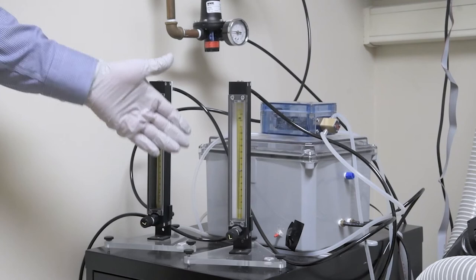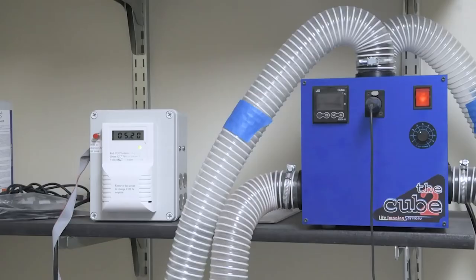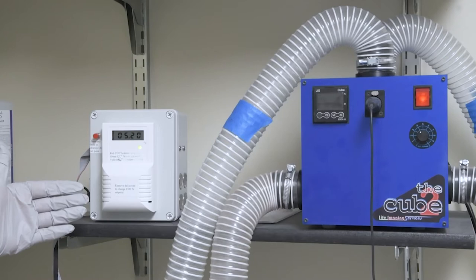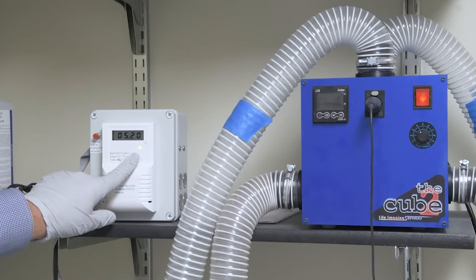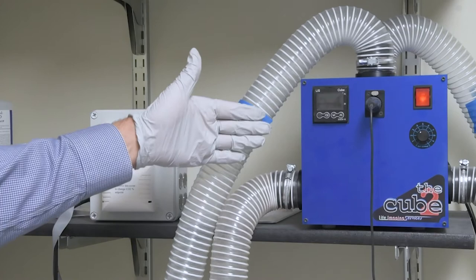Here we have our homemade gas mixing chamber which takes the house medical air and CO2, runs it through these flow meters and gives us 5% CO2 to send into the microscope. Up on the shelf, the CO2 detector will tell you what the CO2 percentage is. It's set to 5%, but as long as that green light is on you know you're within range, between 4.5 and 5.5%, which is acceptable for your cells.